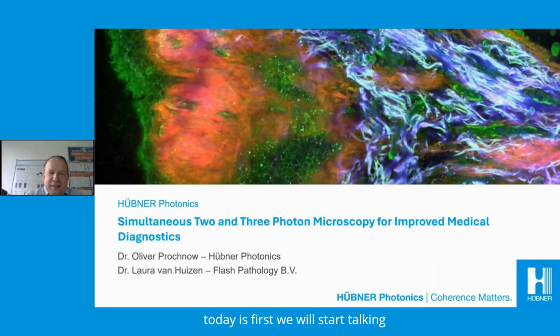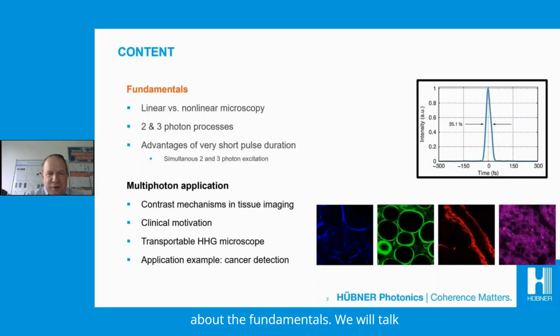The outline for today is: first, we will start talking about the fundamentals. We will talk about linear and nonlinear microscopy, and about 2 and 3 photon processes. Finally, I will talk about the advantages of very short pulse durations, and how you can do simultaneous 2 and 3 photon excitation. And then I will hand over to Laura, talking about multiphoton applications.